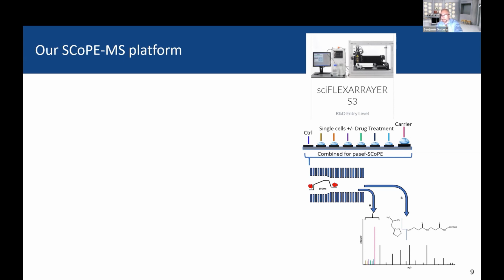It looks like what everyone else is doing. I am missing a control here. We found that having a control between our carrier and our single cells is very important. And because I'm in a pharmacology department, everything we're doing is focused on understanding how drugs work, or drug toxicity, or how our cells are building resistance to drugs. So that's all that we're doing here.